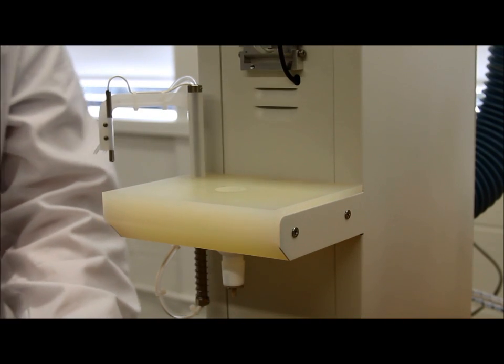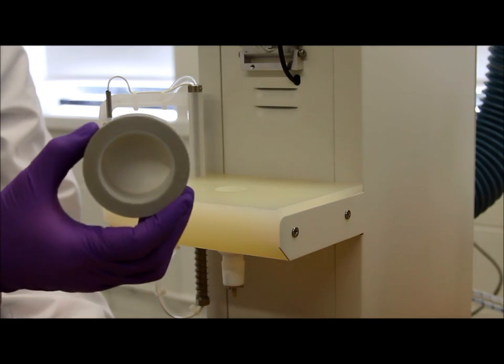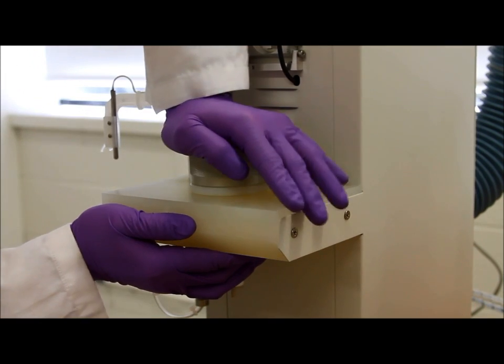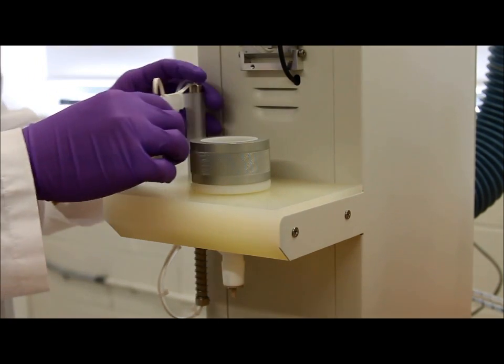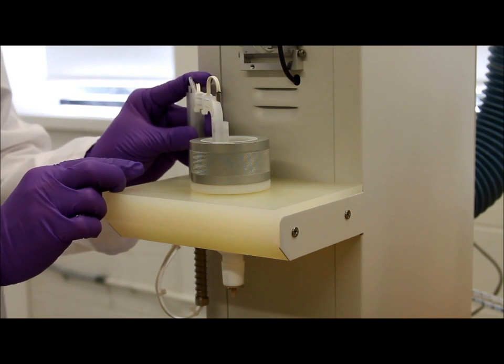To begin your method and assemble the apparatus, grab your disc holder with your SPE disc inside and place it on the disc holding platform. Grab the pre-wet arm and lift it up and place it into your disc holder.